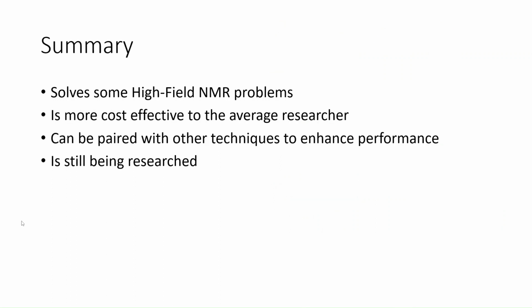To summarize, zero-field NMR has its drawbacks, but it also solves some of the problems and struggles that we have with high-field NMR, as well as being less expensive and more portable. There are numerous ways to apply zero-field NMR that can either achieve better performance than high-field NMR, or in ways that high-field NMR can simply not be used. This application has grown leaps and bounds over the last decade, and there are so many more things that we can do with it even still.